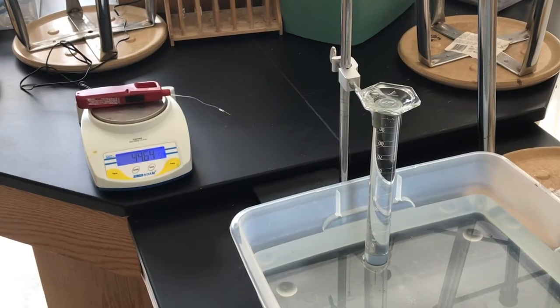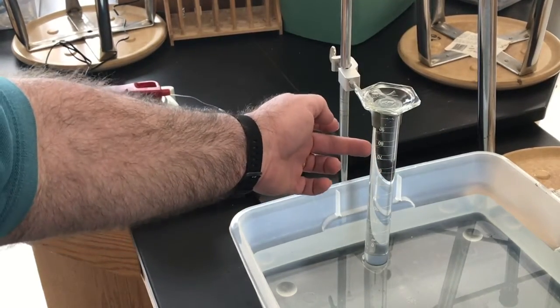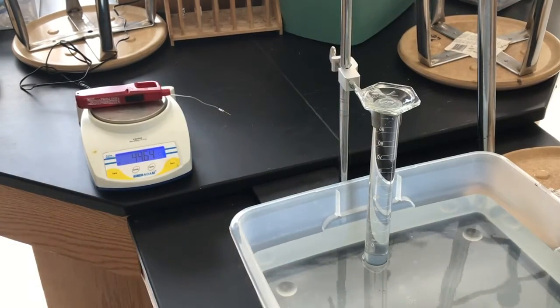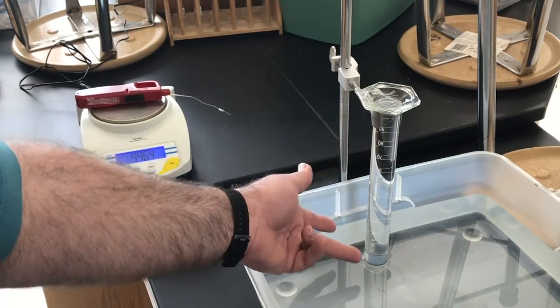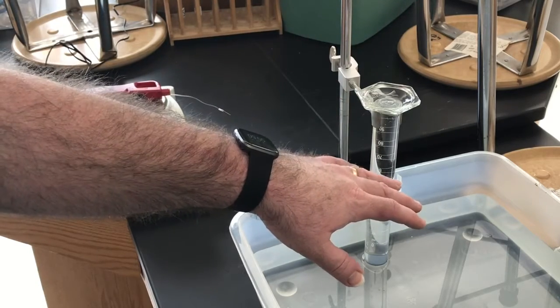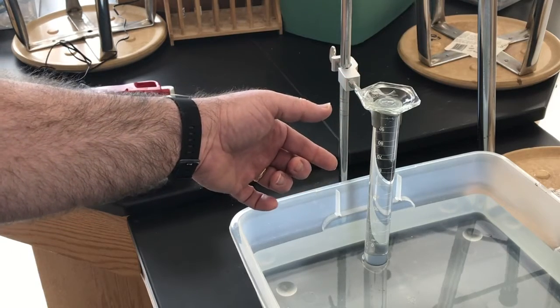What I have set up here is a gas collection setup. I've got the graduated cylinder inverted. It's full of water and it's in a tub of water. The way this works basically is you have the gas go into the graduated cylinder, and of course it's less dense, so it's going to rise to the top, which is going to push out some water. That way you can measure the volume of the gas.